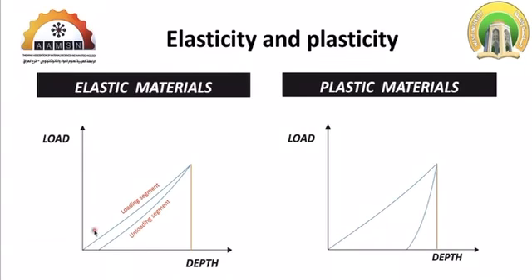Okay, sure. So the unloading segment, which is the most important segment of the curve, when we decrease the load, the depth, the distance.